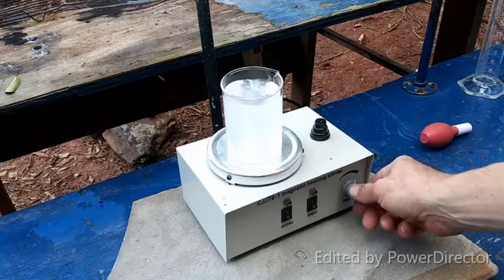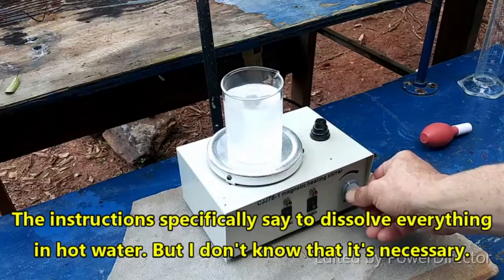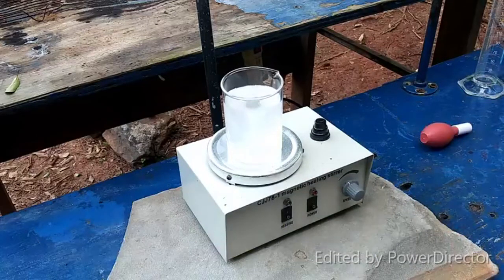Looks like it's all going to dissolve pretty readily. I'm going to let it heat up and I will come back when everything is dissolved and it's at the correct temperature.